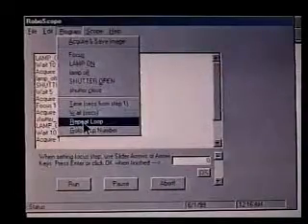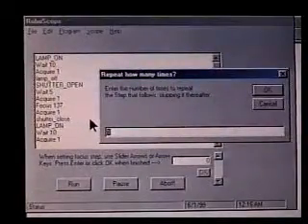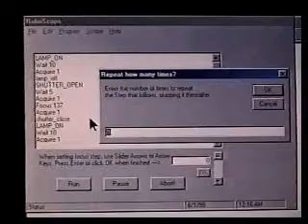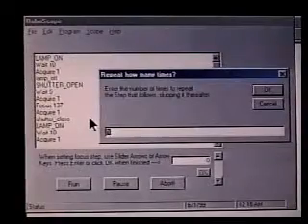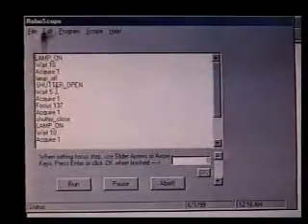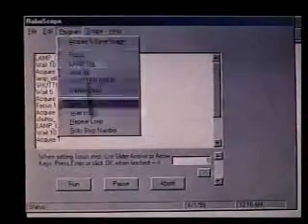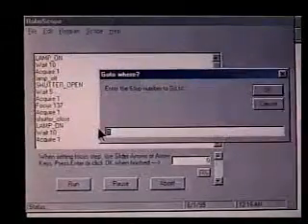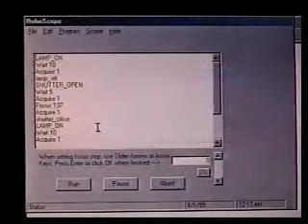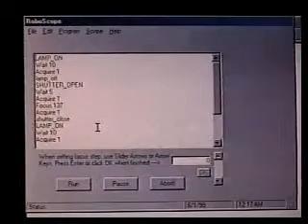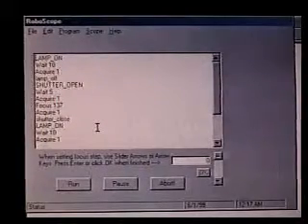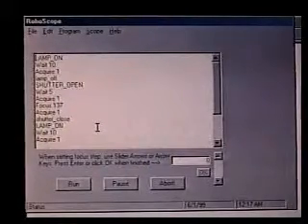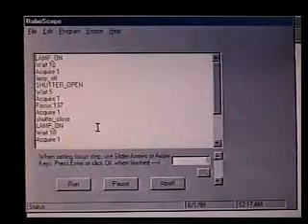And then after ten seconds, we're going to start a repeat loop. We're going to repeat all these instructions just once for the sake of brevity. And what we're going to do is we'll repeat the instruction which follows repeat, which is go to, and we're going to go to step one. So, the program will do this whole thing, and then repeat the whole thing one time.